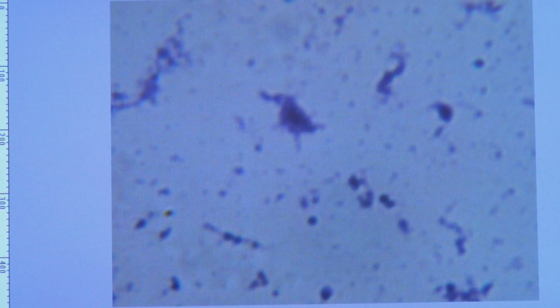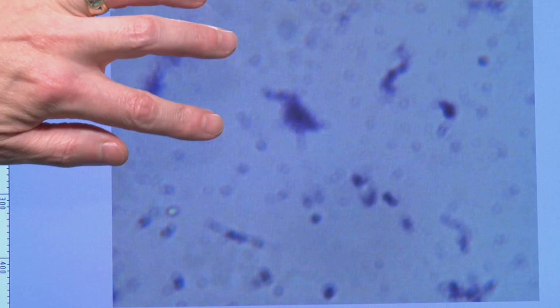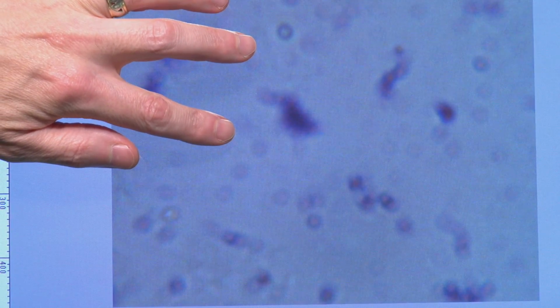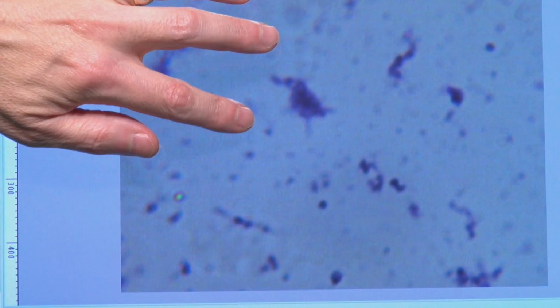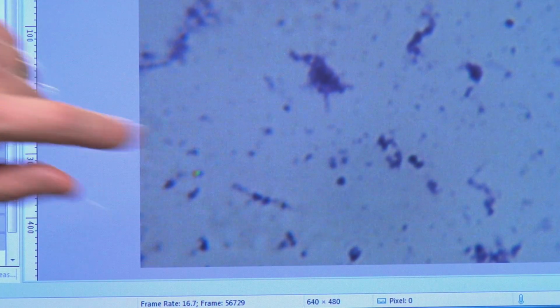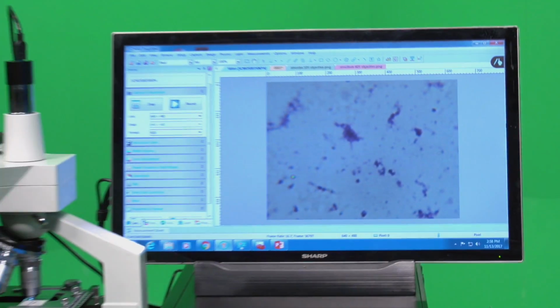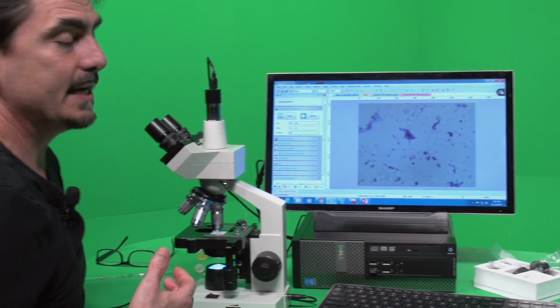And so here, these right here, you can kind of see them. When they're out of focus, they look even more circular. But this is an example of individual cocci. Boom, boom, boom. Each of these is an individual coccus. So those are what we're getting from this slide that I have. Okay, so not the best.